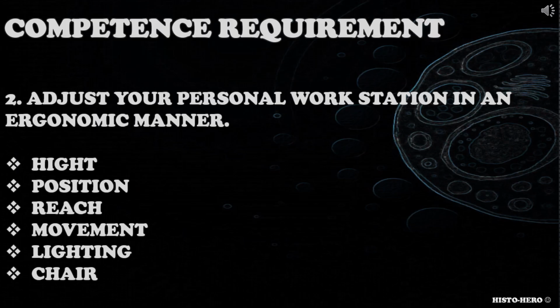When addressing this competence requirement, candidate could consider bench height, position of microtome and position of other equipment used during microtomy, ease of reach, body movement, lighting, chair used and so on.